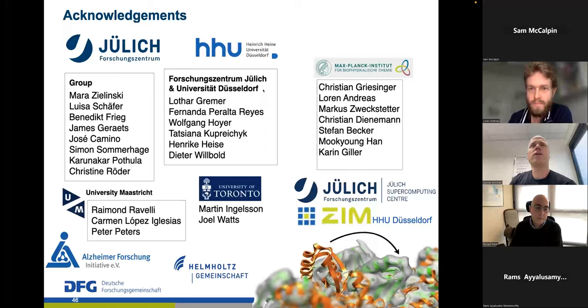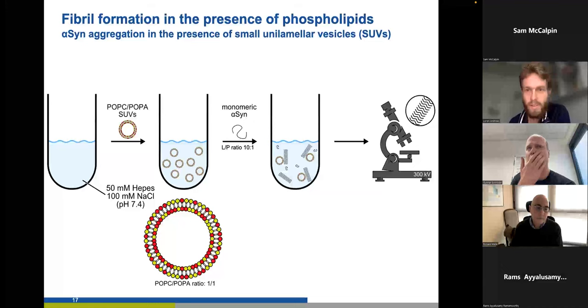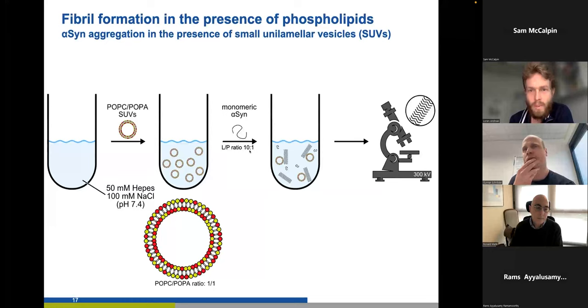I thought we had a 10:1. Didn't we have a? Yeah, so I can comment on that. We use both 5 and 10:1 for different experiments, and I would have to check the paper to know exactly which was used for which data set. And between those, there was not a huge difference. Of course, there's also the difference between using PMCA or shaking or quiescence.